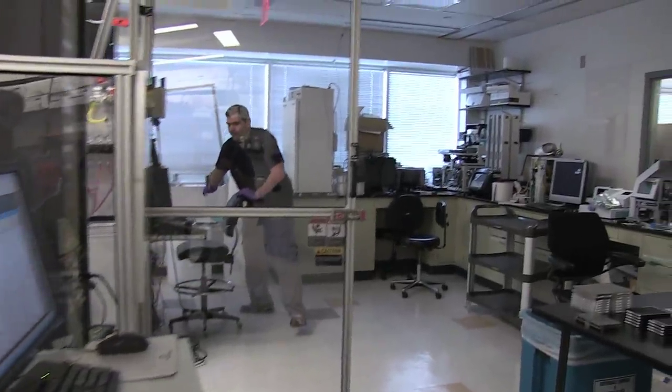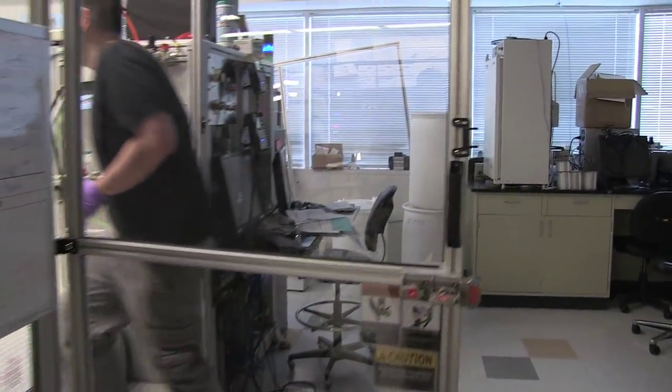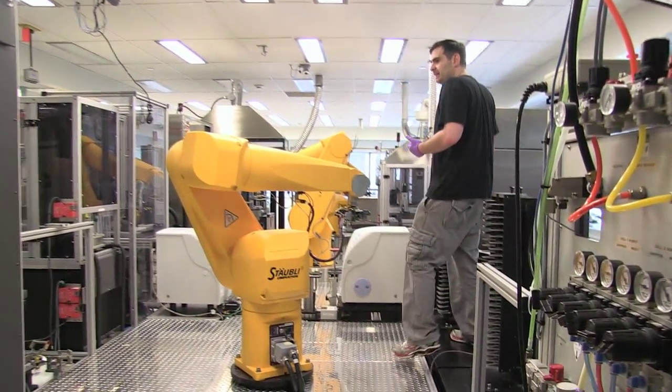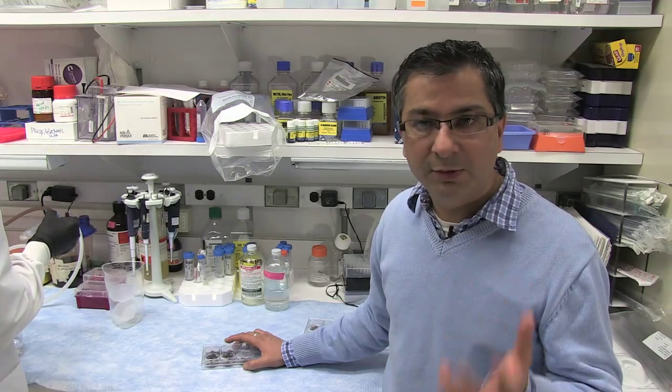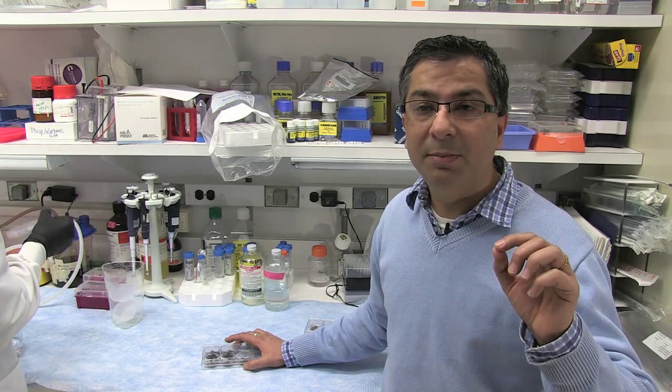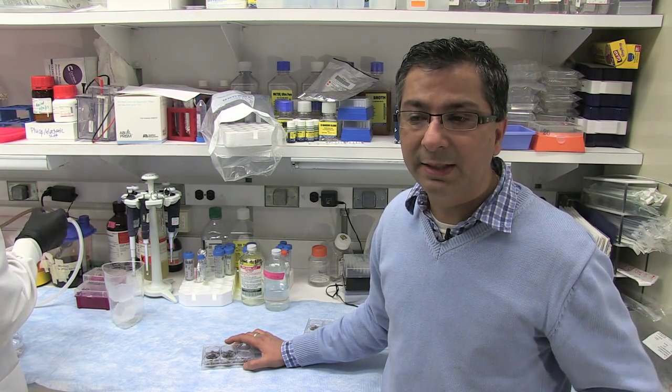So Sam is a robotic engineer that programmed the robot. And now he's giving me grief because one of the assays is really difficult. For the first time this is possible that actually you can take patient cells and be able to study their disease processes in a dish.